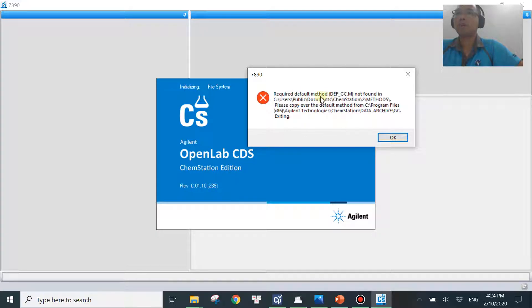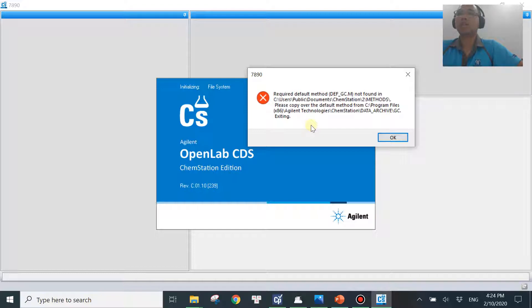What happens here is the software is trying to look for the method called default_gc.m, and for some reason this method is not available or not present in the method folder. There are a couple of reasons why this could happen. A very common one is that default_gc is something the lab is not using, so most labs archive this method, move it to another folder, or even delete it.